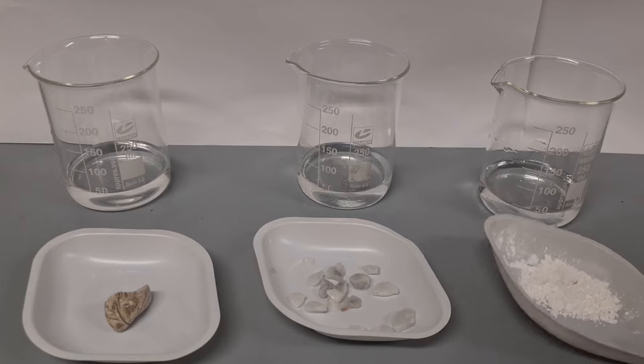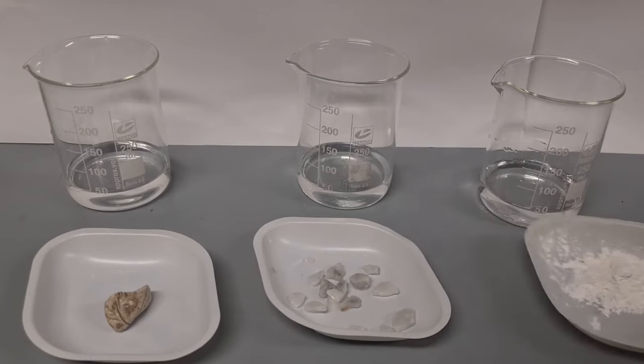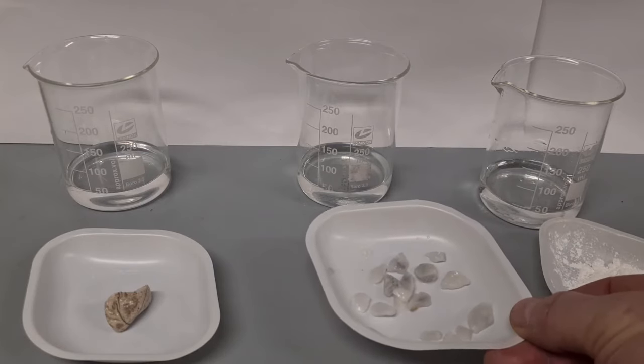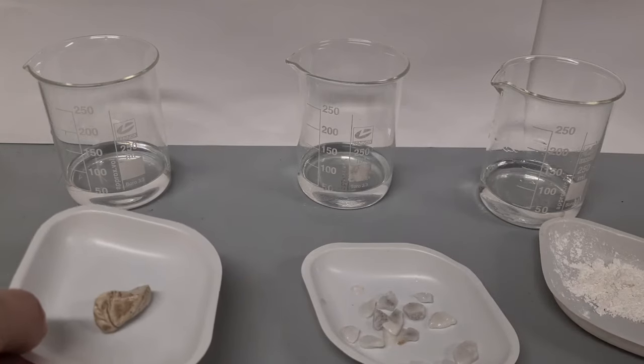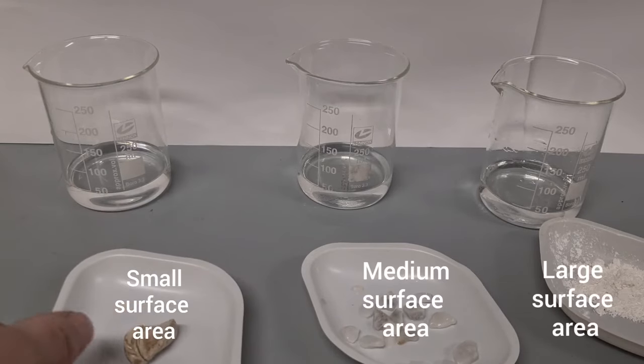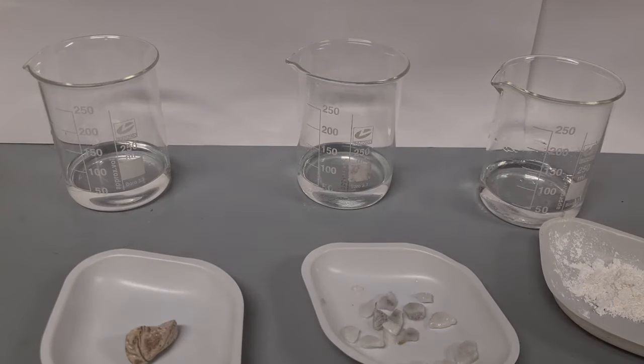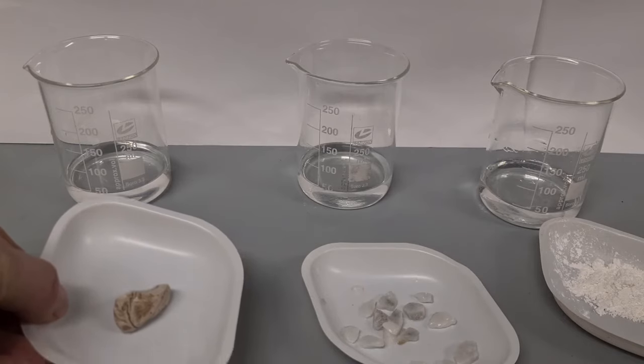The difference is this tray contains finely powdered calcium carbonate. This tray contains medium sized chips of calcium carbonate, and this tray contains a 10 gram piece of calcium carbonate. We want to examine the reaction rate or the speed of reaction when I add each sample of calcium carbonate to the acid.